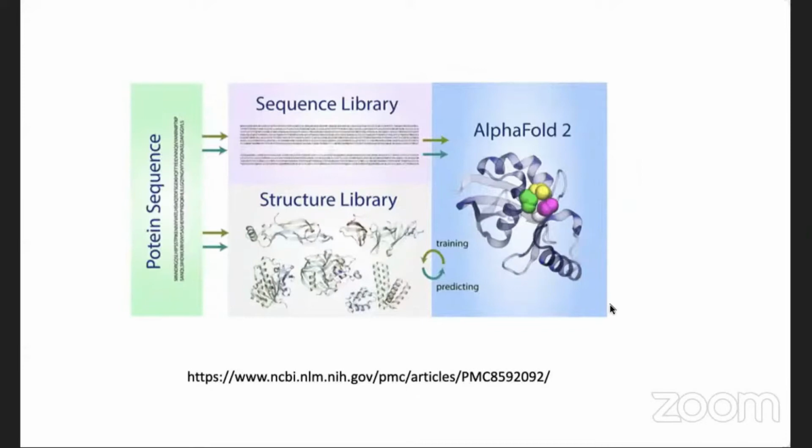prediction. So another thing is that the structure of a protein can be used to infer its biochemical function, right? That's one of the objectives. But you can also perform virtual ligand screening to predict which small molecules or drugs it might be binding and how it is binding. That is a session we covered in the last session, where we covered virtual screening and software involved in virtual screening, which is publicly available. Anyone can start using it, download the publicly available data from ChEMBL and other repositories, look for similar structures, use cheminformatics, and then use virtual screening software to find out maybe the top 1,000 or top 100 molecules which you would want to take forward, using maybe docking or other protocols.